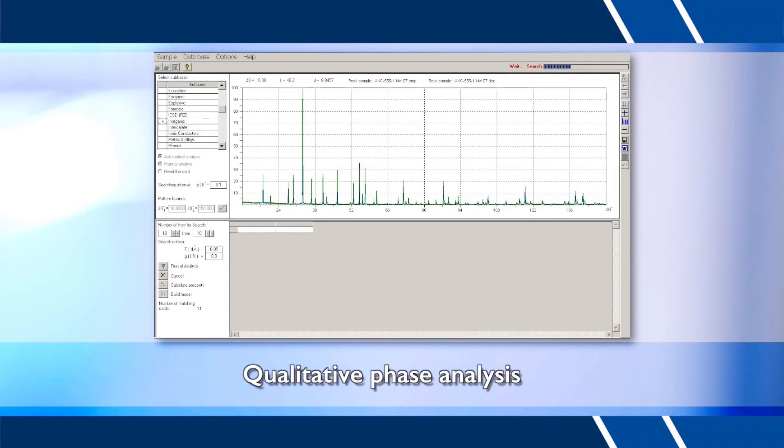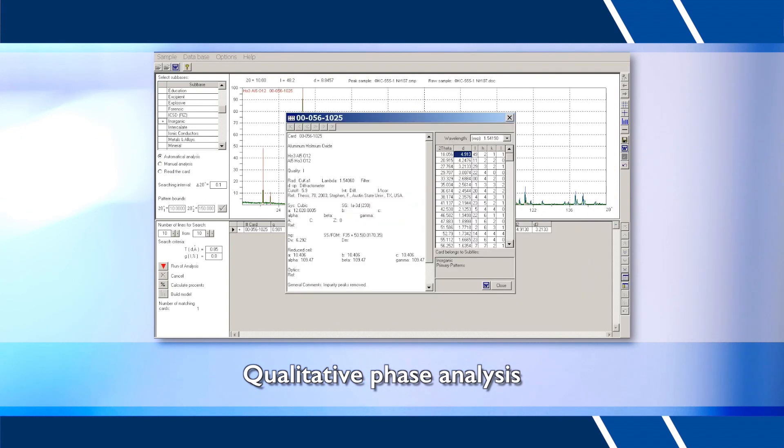Qualitative phase analysis, the identification of sample composition, is carried out with the help of PDF2 powder diffraction database.